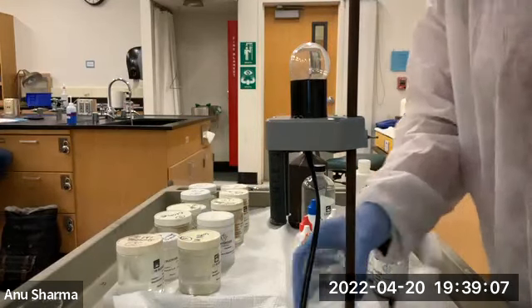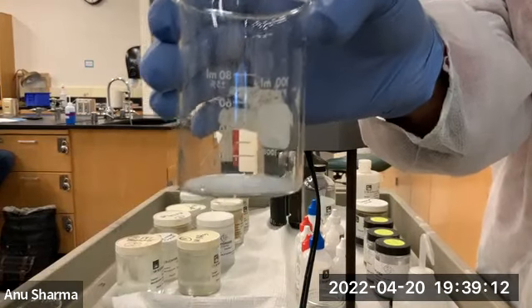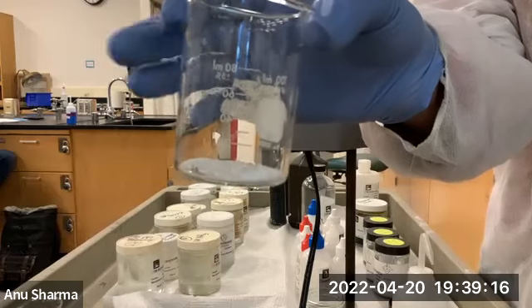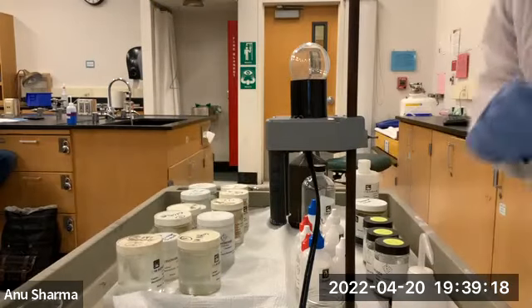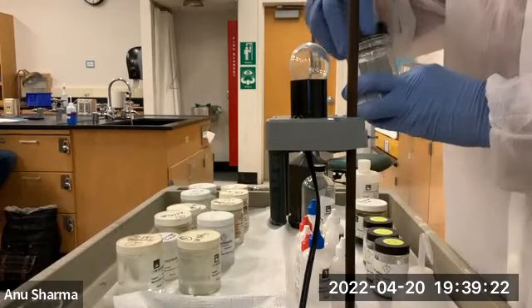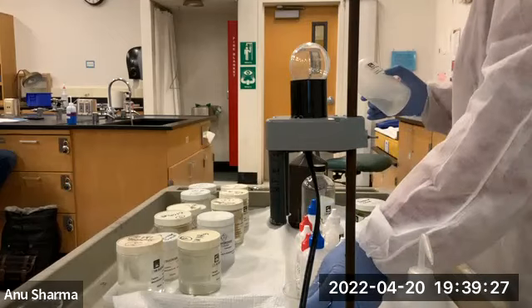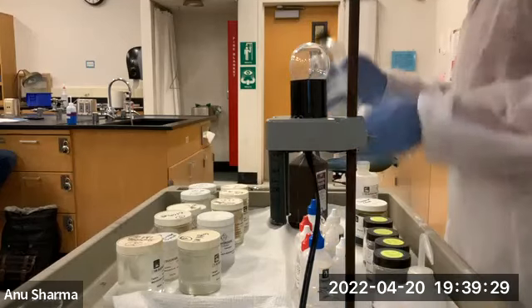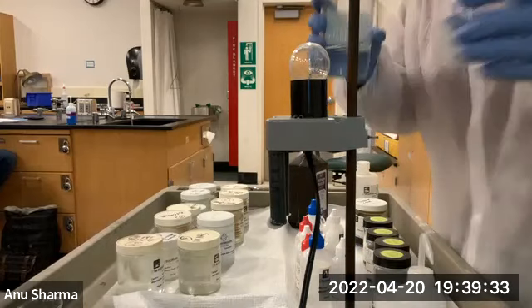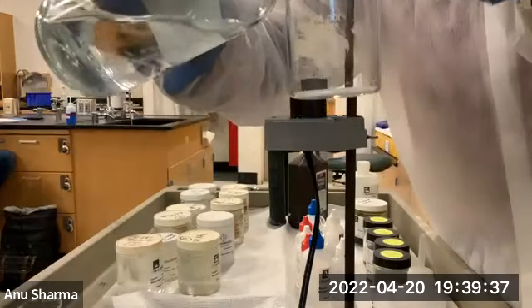So here I've added some baking soda to the empty beaker. Close it and add water to it. Here I'm going to add DI water because you want absolutely clear water. So here's the DI water added to baking soda, and we'll see what happens.